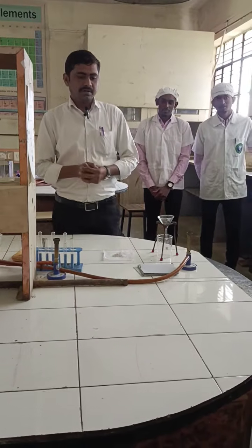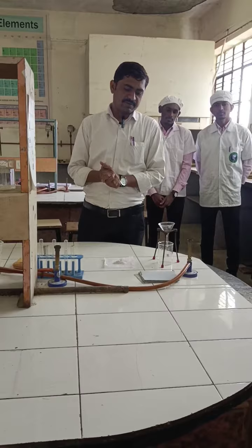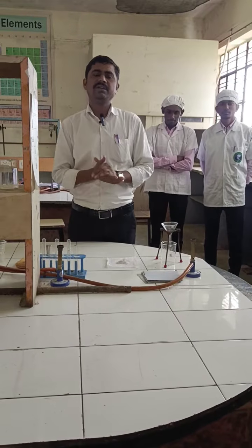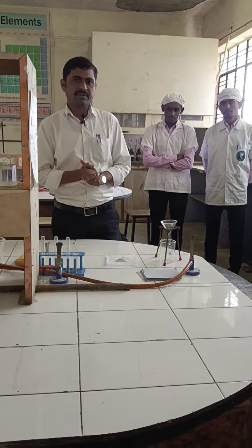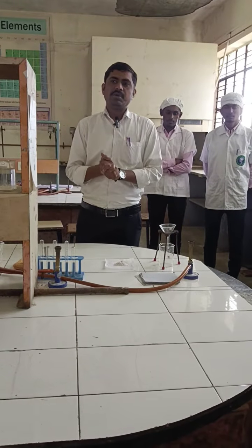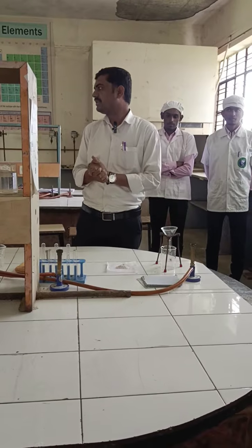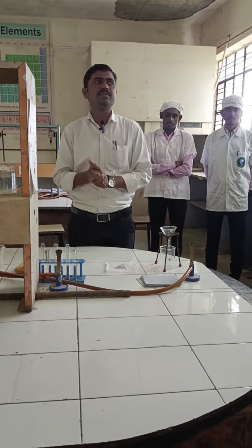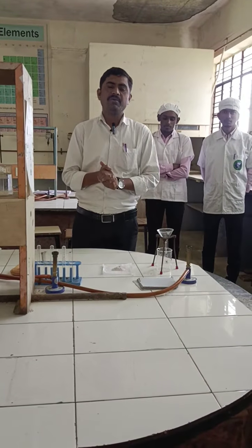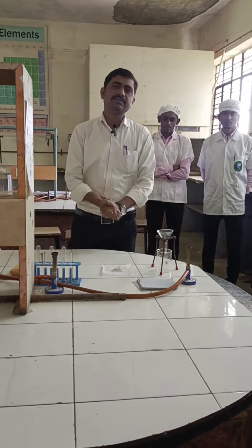So today, the aim of today's practical is to identify given unknown compounds present in a given binary mixture. Today we will see how to identify the given unknown compound present in the given binary mixture. That is a qualitative analysis. We are going to identify the compounds present in the given mixture.